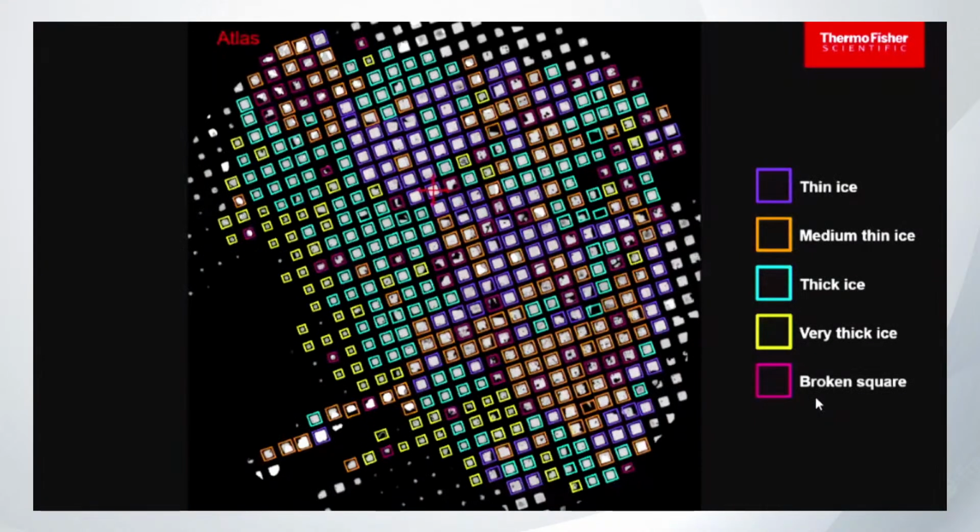So once you have that, you have the perfect sample. All the biochemistry done, you are able to vitrify the sample, very cool, you have the perfect ice, the perfect particles. You go to the microscope right now, okay? Of course, when you are working under cryo conditions, everything touching that grid needs to be under liquid nitrogen. Once that cryo grid is vitrified, you need to store it in a dewar with liquid nitrogen, and you can store it for months, no problem.